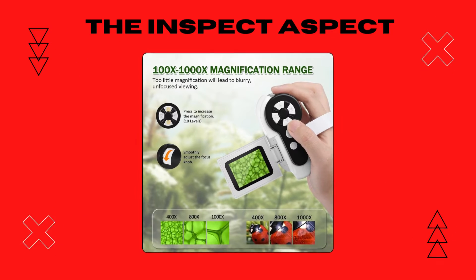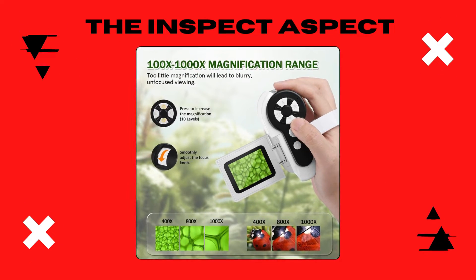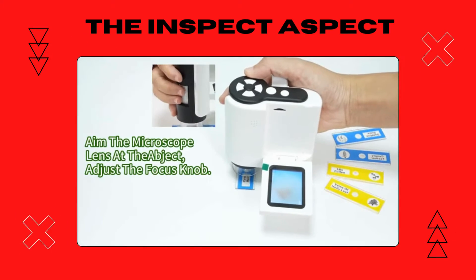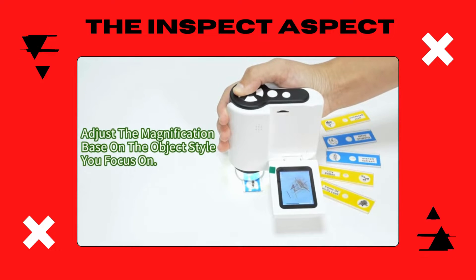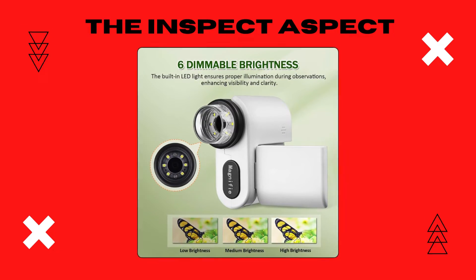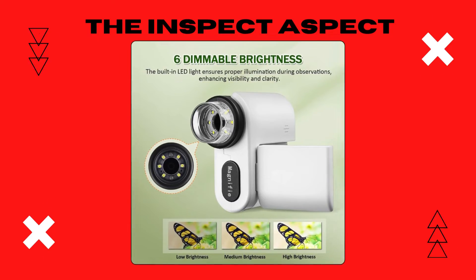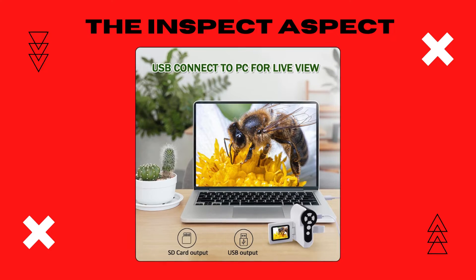This isn't your traditional microscope. The Barkrons is a handheld 1000x microscope tailored for kids aged 8 to 12. It's equipped with a 2-inch LCD screen, making it easy to explore without squinting through an eyepiece. What's impressive is the six adjustable LED lights, providing clarity and detail to every observation. And with the ability to connect to a PC via USB, kids can save and share their discoveries.